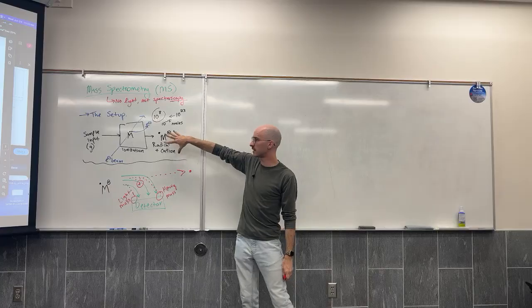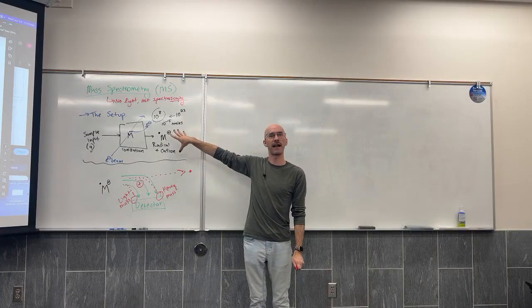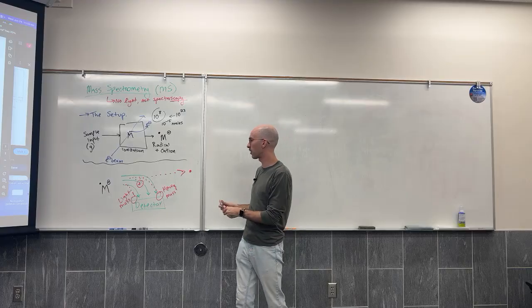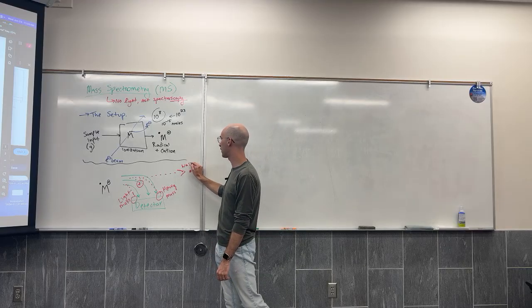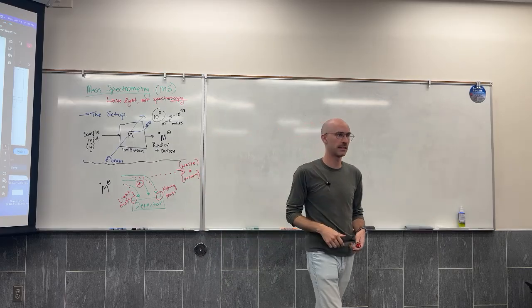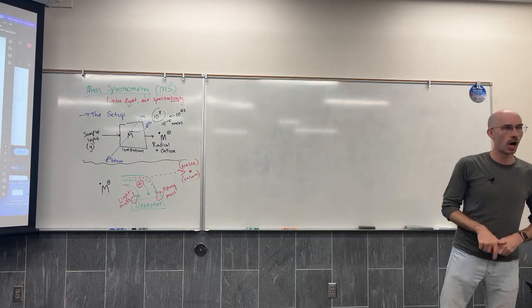And this entire thing is happening under vacuum. So all those other fragments, they just go to the waste. They go into the vacuum. Radicals, not affected. Cations are affected.